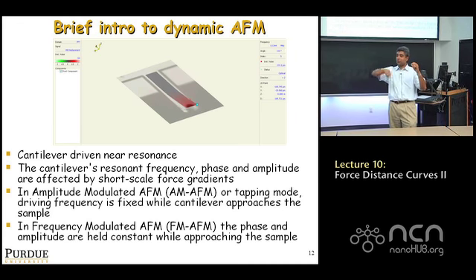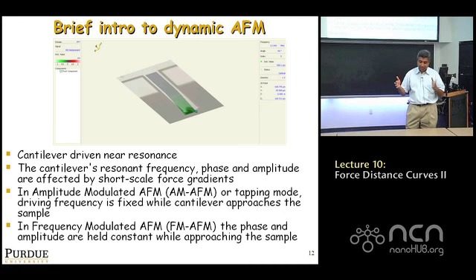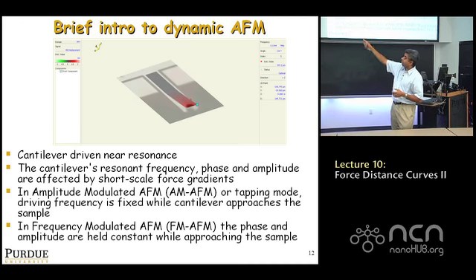The second eigenmode is more, or you can have an acoustic cavity, very similar things. In the same way, cantilevers have these eigenmodes. When you do dynamic AFM, you typically choose to drive it at one particular eigenmode. This is what's called the fundamental eigenmode. It's oscillating like this, but at a very specific frequency.